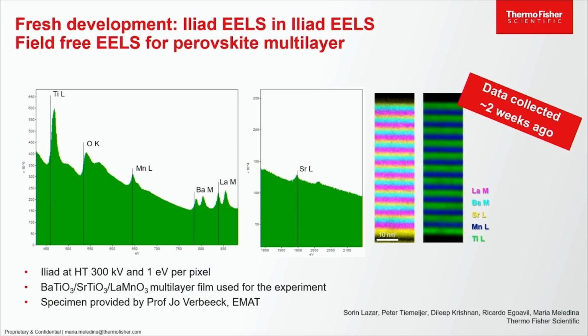And of course, I love spectroscopy, so we also did field-free EELS for one of my favorite samples, this bunch of perovskites on top of each other. And there is no problem doing the chemical analysis in it in field-free. That's really very fresh. We just started playing with this, taken a couple of weeks ago.